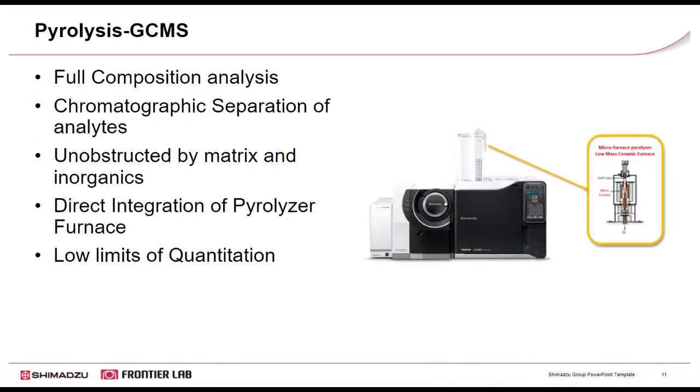In summary, Pyrolysis-GC is a robust yet simple technique for analyzing microplastics. With very limited sample prep, full composition analysis of microplastics is possible. PYGCMS also negates the potential obstructions of adverse matrix effect and does not exclude polymers based on their size or their shape.